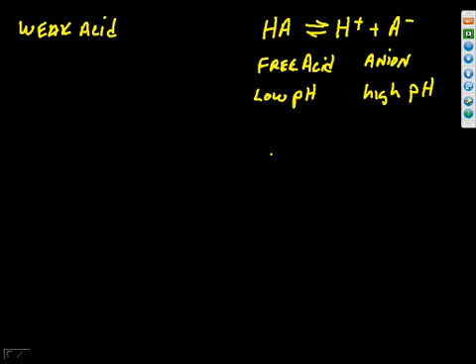Now, if we're talking about reverse phase, retention is based primarily on hydrophobicity. Like dissolves like, sticks to like. And so we need to consider the hydrophobicity or relative hydrophobicity of these two species. Now, Chemistry 101 says if I have two possible forms, one neutral and one charged, it's very likely that the neutral form is going to be more hydrophobic. It's going to be greasy, it's going to be organic soluble, however you want to interpret that. And in contrast, the ionized form is going to be hydrophilic. It's going to be more water soluble, if you will.